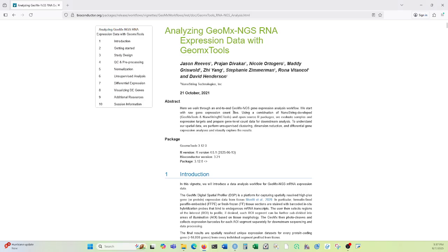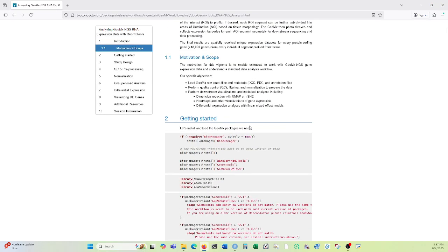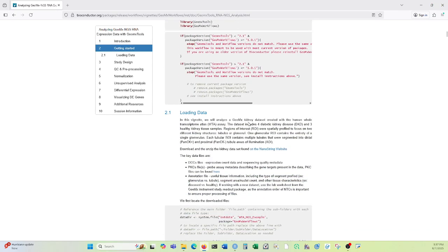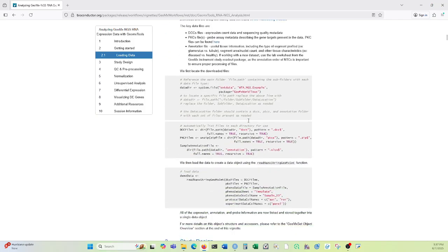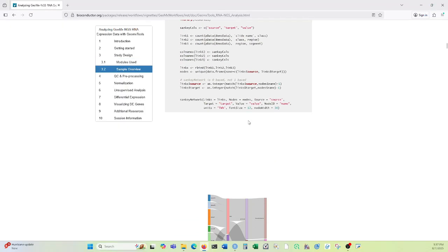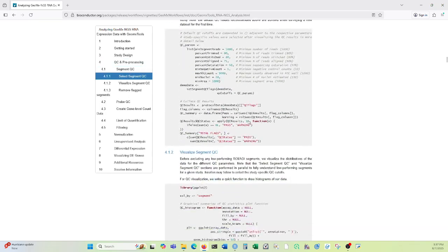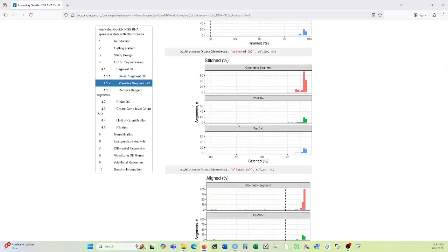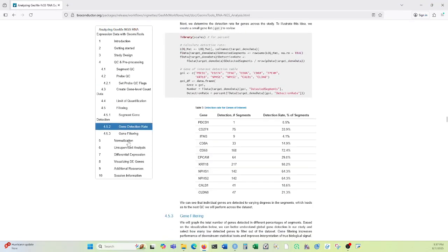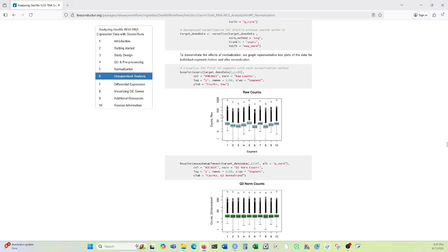Today I'm going to be going through this one at a time. It's a very extensive data processing tool, so much that I'm not going to cover all of it today. I believe I only get to about here. This is when I stopped working on it because it was a little bit too much.